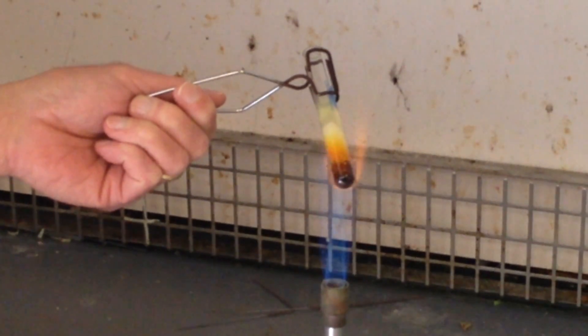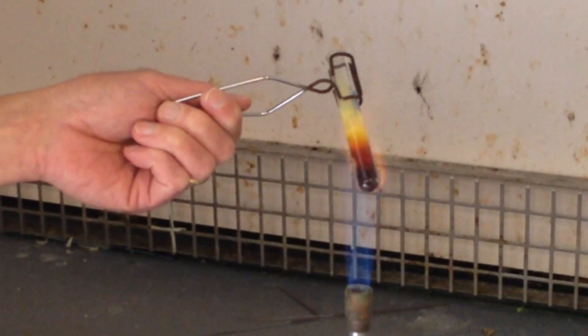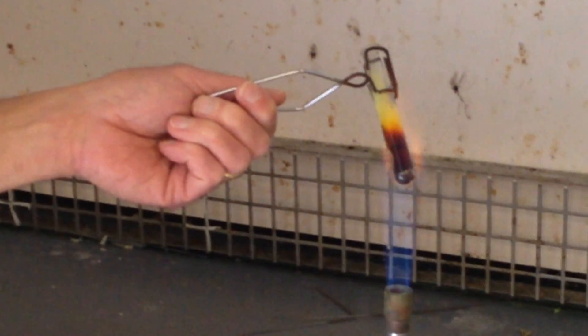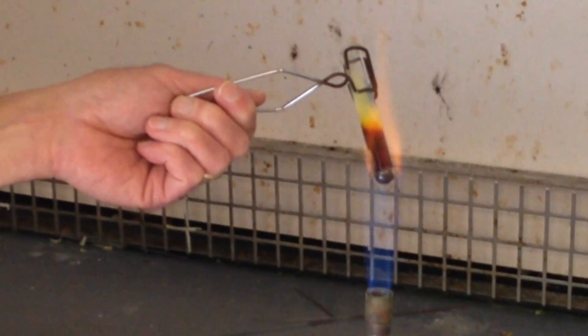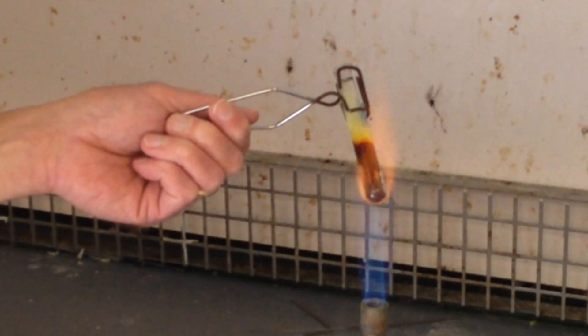It's even starting to boil. You get some sulfur condensing on the sides of the test tube, and a lovely odor of sulfur gas.